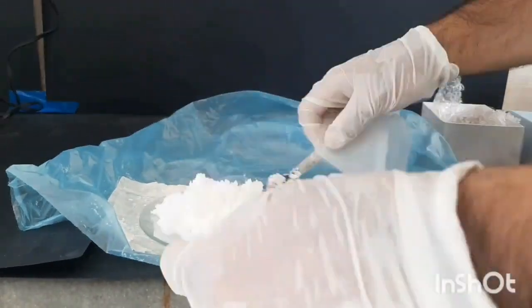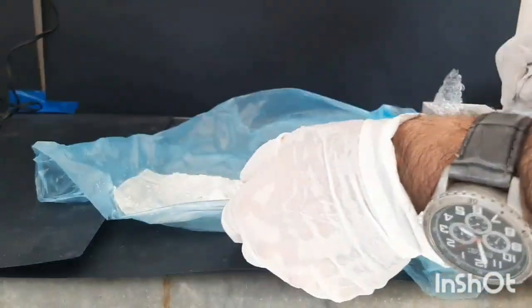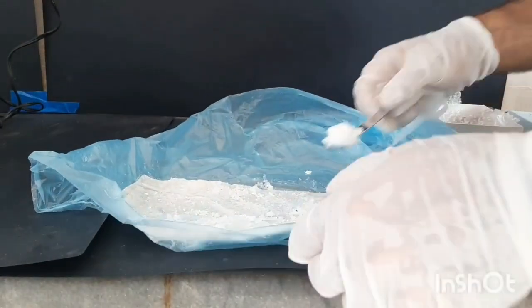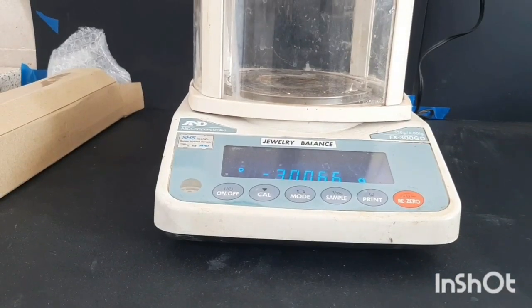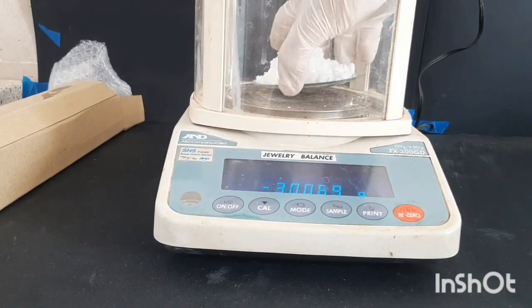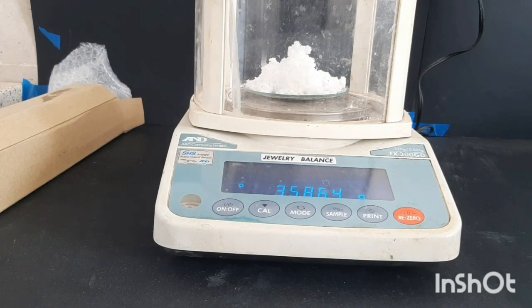As you can see by scraping off the adipic acid, I leave behind some product. So I weighed the paper towel before adding the adipic acid mixture to it, and it increased in weight by 1 gram. After drying, the mixture was around 35 grams.